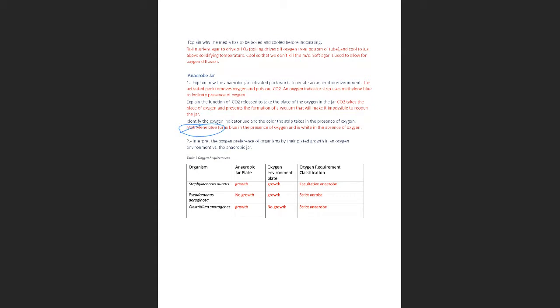As far as these jars, the only thing you can distinguish on these jars will be the strict aerobic, strict anaerobic, and facultative. An aerotolerant will be difficult to distinguish because it would look like a facultative. It would grow across the board. The only difference is that it may not grow as well, but it would grow anyway. So those will be difficult, and that's why they don't even give you an aerotolerant in here. It's just so you can interpret given results like these. Now, one more thing, and I'll come back to these and explain it in just a second.